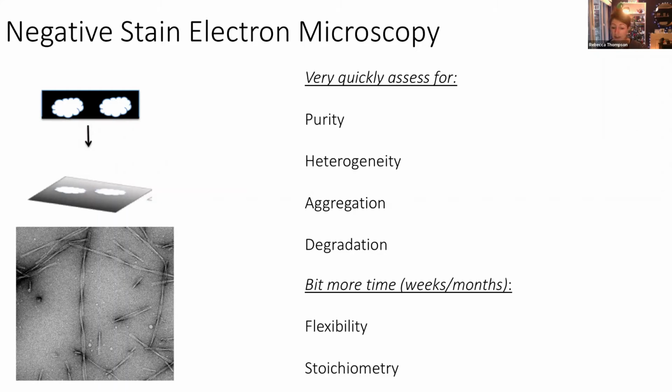And if you spend a little bit more time collecting more images and then processing those, then you can also get some information about flexibility, stoichiometry of complexes, that kind of thing. So it's a really, really good starting QC method in our experience.